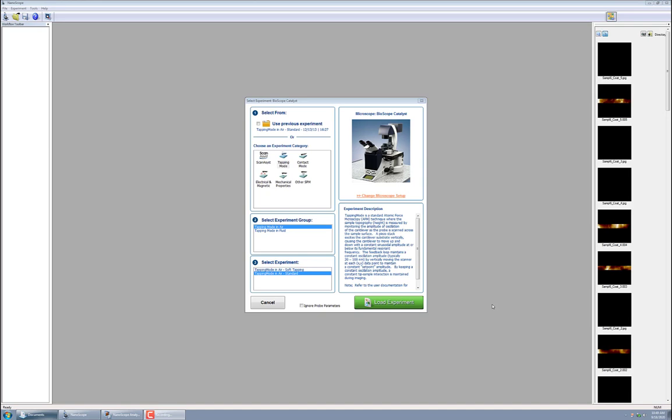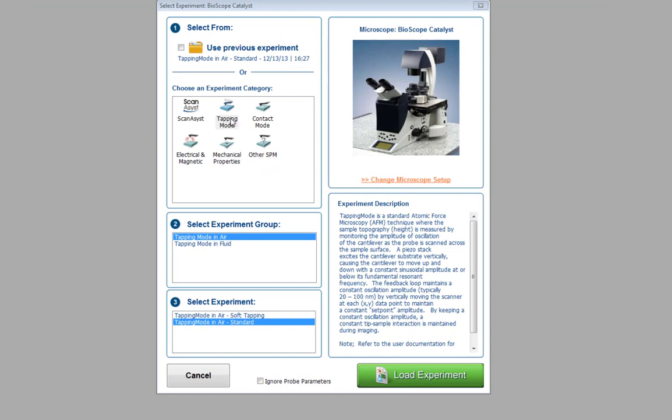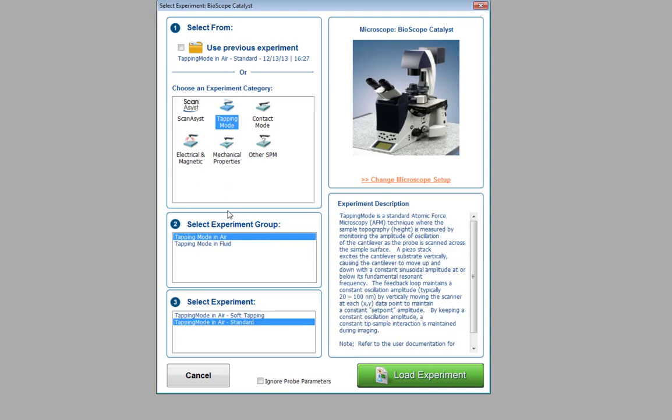The first thing we need to do is connect to the instrument so the laser will turn on. We're using the proprietary software called Nanoscope, and we need to connect to the instrument and select the mode. We're going to run in tapping mode, doing this in air rather than fluid, and select standard tapping mode. There are many different experiment types, but we'll cover tapping mode basics, and then hit load experiment.